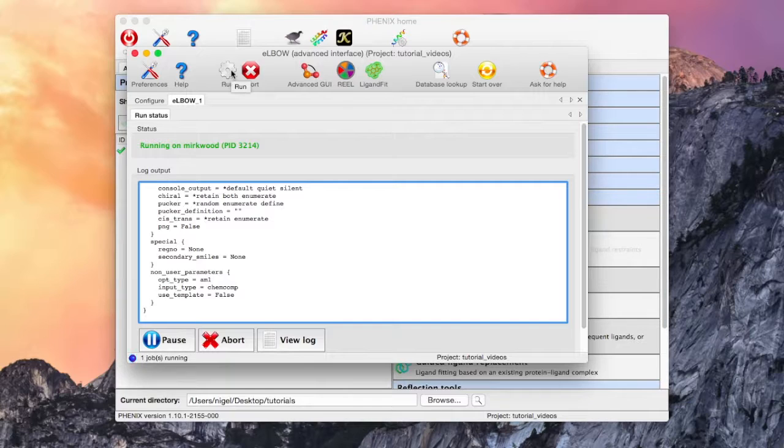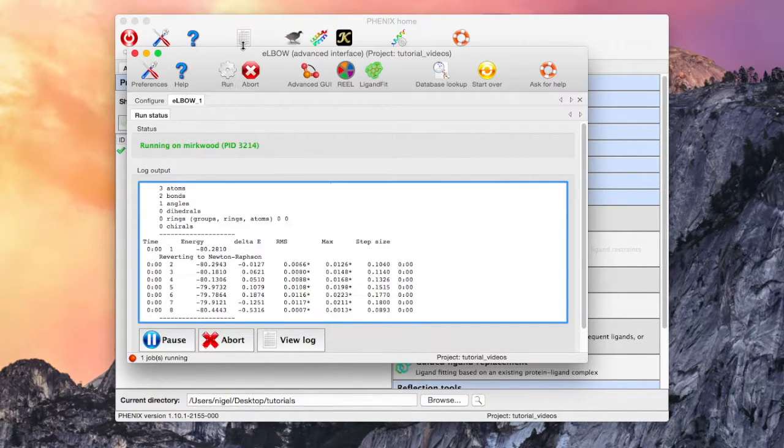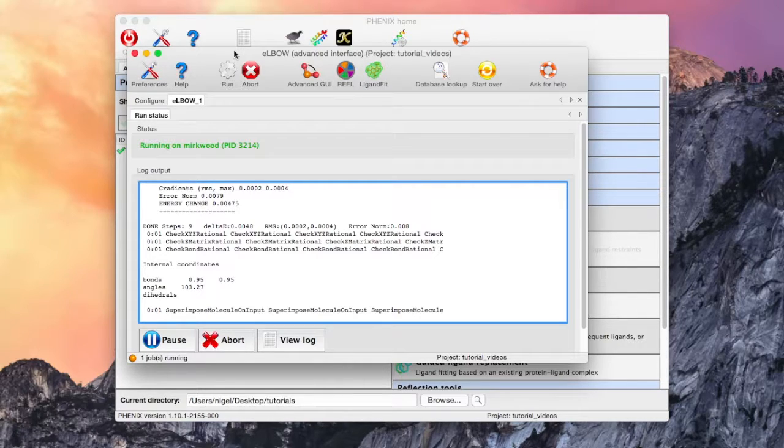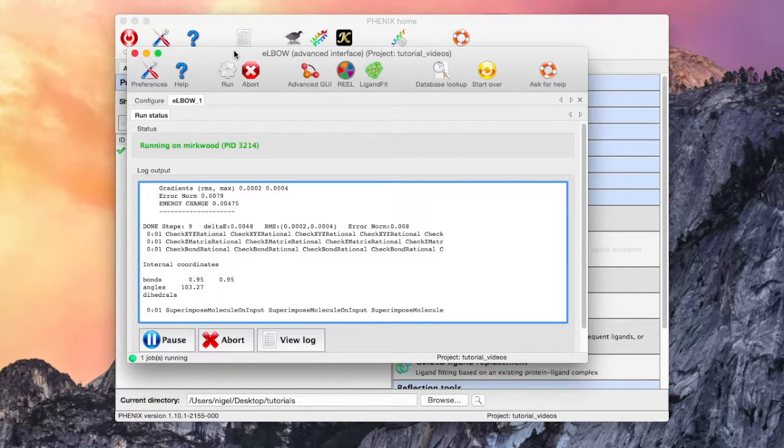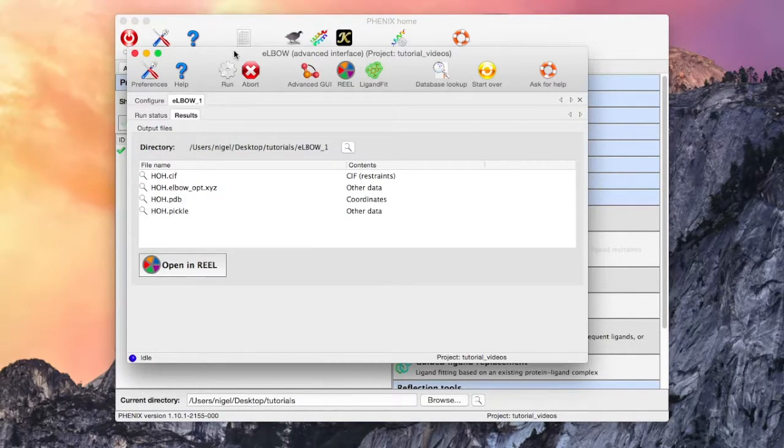Clicking on run will run Elbow, which is very quick for water. The log file is displayed in this field and the output files in the results tab. A successful job will result in a PDB file and a restraints file in CIF format.